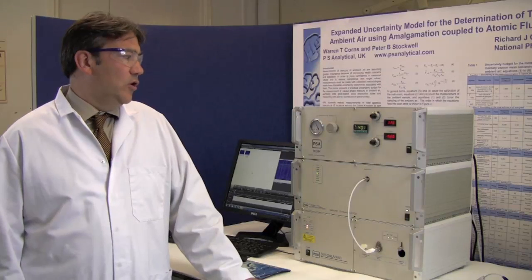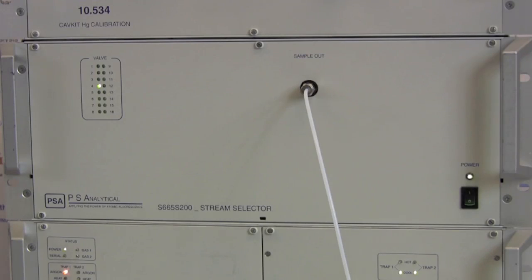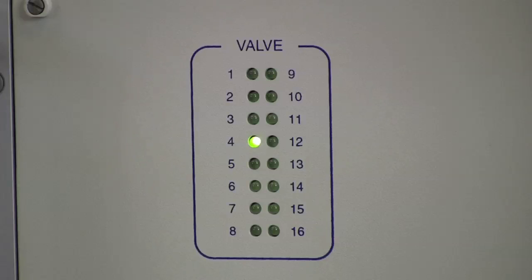When this instrument is used in an online situation we couple it to a stream selection unit which allows us to select different sample streams and also to introduce a zero and a calibration gas.